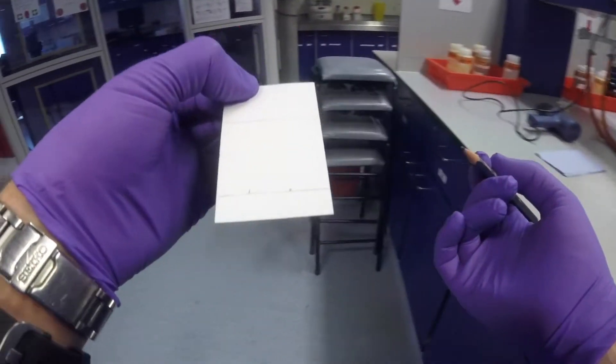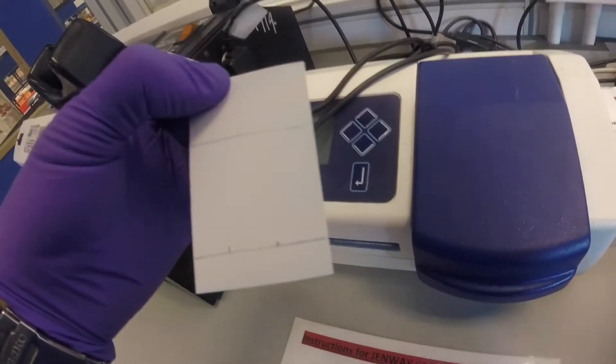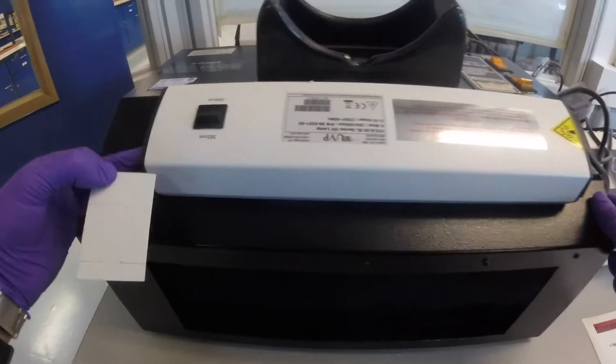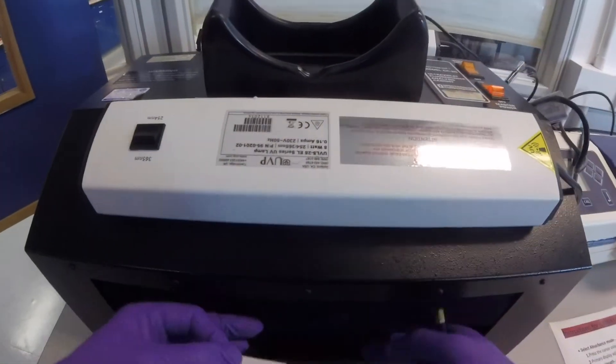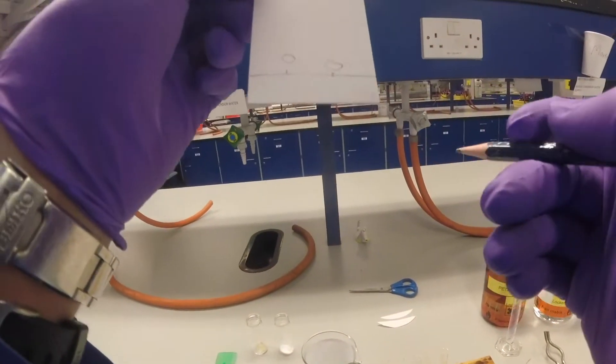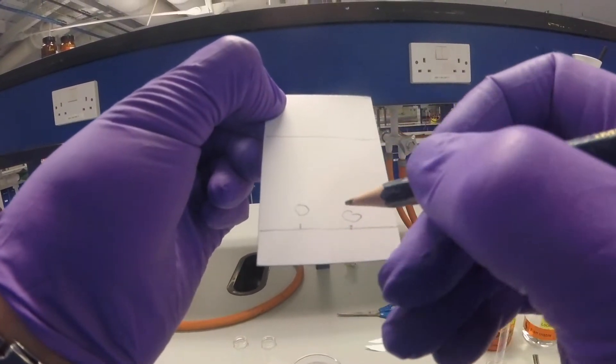Come in here, switch on our power. We'll pop this under here, see if we can bring the camera up. Hopefully you can see that we have two spots, one here and one here. We're going to draw around those and bring them out. So this is where our spots are. This one's higher than this one, this one's much lower down.